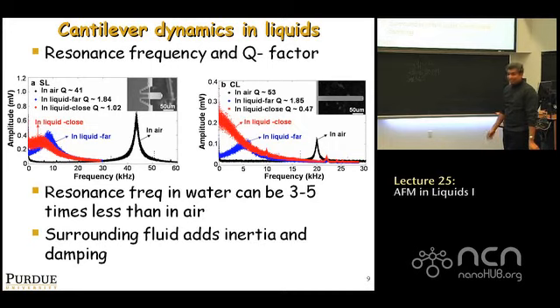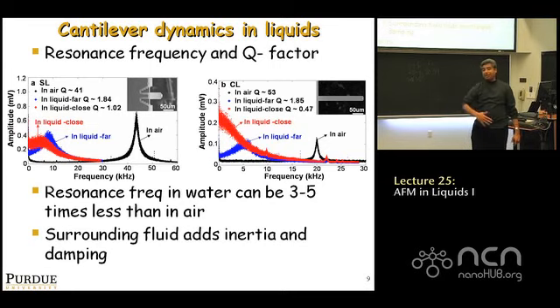Unfortunately, it's not very easy in most AFM systems to withdraw just by 10 nanometers and do a thermal tune. It's not so easy. Right. It's all set up to do one click and you withdraw 2 microns, and so you really move far away from the sample.